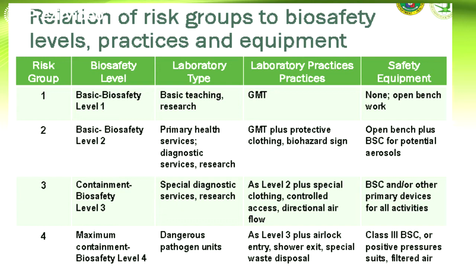Okay? So, the level 3 plus airlock entry, shower exit, special waste disposal, ito mga kailangan nyo. And for the safety equipment, you need class 3 biosafety cabinet or positive pressure suit and filtered air. So, pati mismo yung air na meron tayo sa isang lab, it is also being filtered pagdating sa dangerous pathogen units. Okay? So, ito yung mga specialized lab natin.